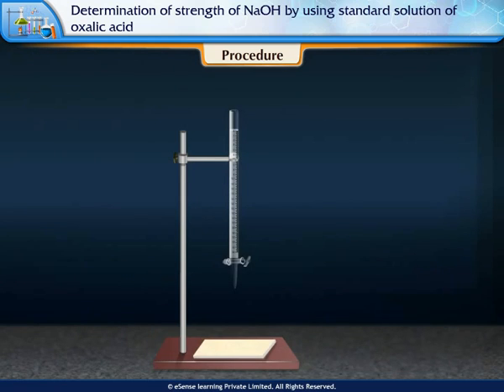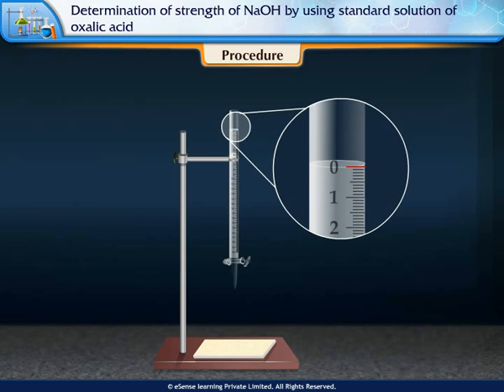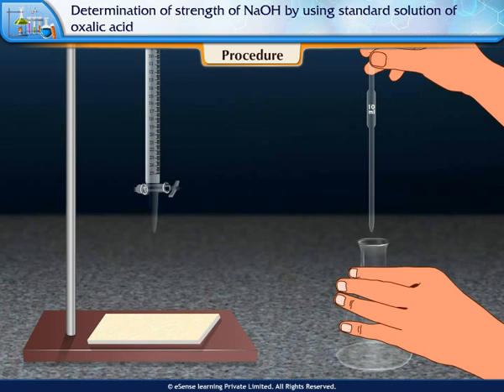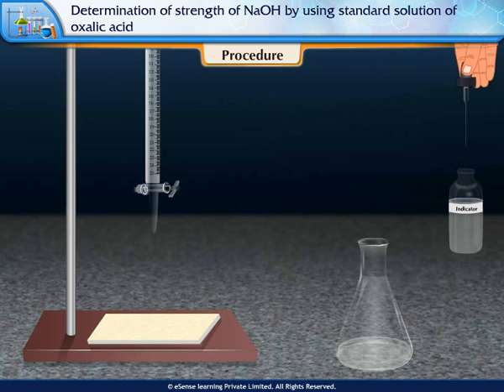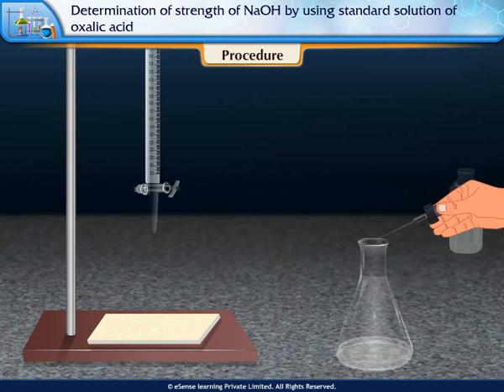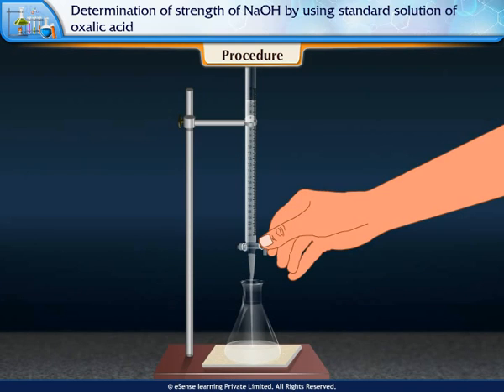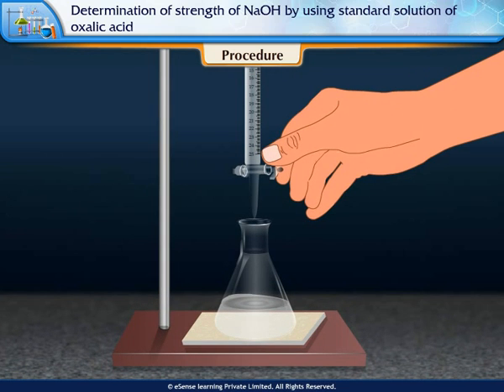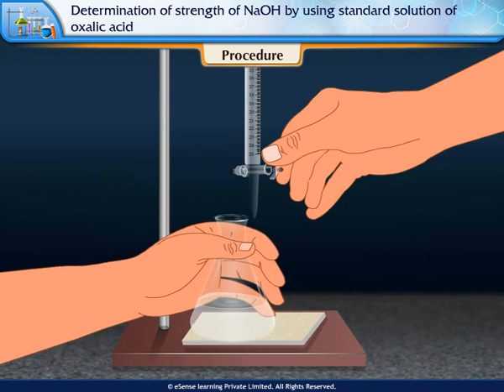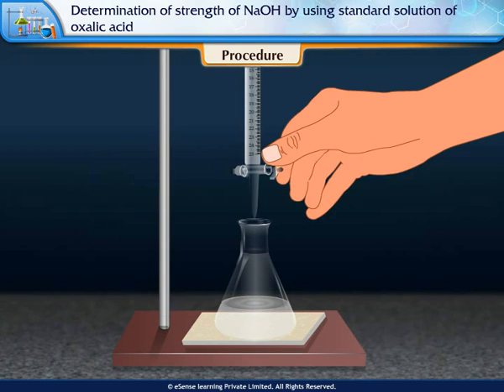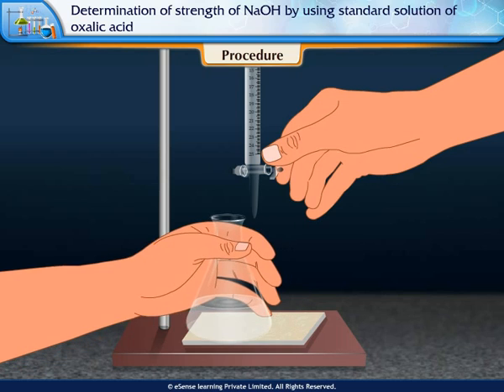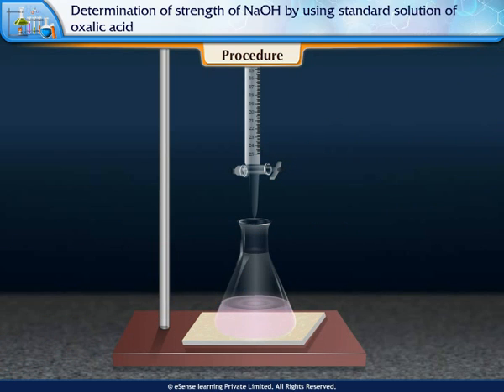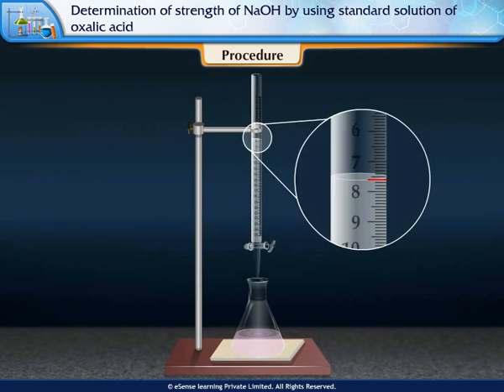Refill the burette to the 0 mark so the initial reading is 0 cm³. Pipette out 10 ml of the given oxalic acid solution and add 1 to 2 drops of phenolphthalein indicator. Add 7 cm³ of the burette solution directly into the conical flask with continuous shaking, then add the burette solution drop-wise until the color changes to light pink. The burette reads 7.6 cm³.